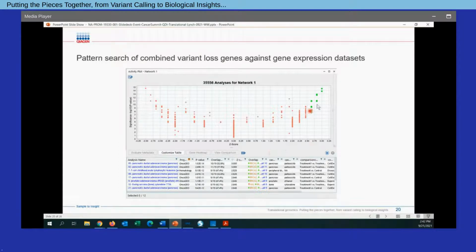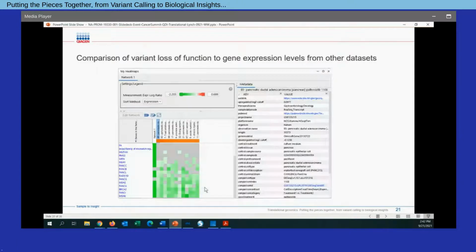And so within this, we can select points that show a high degree of conservation in this loss of activity for our given set of genes. When we select these points, we can get a list of studies here. We'll go into this in a little more detail in the software. From this point, for any of these studies, we can ask the question: when we see this pattern of expression change overlap with our loss of function pattern, what genes show concurrent loss of function and a decrease in expression in these studies? And so this translates us back to the heat map that we saw in the beginning.